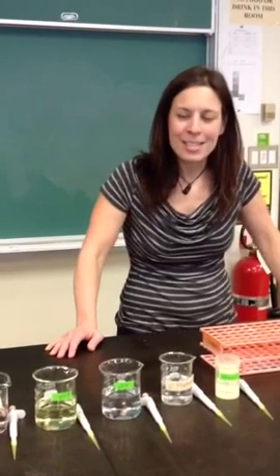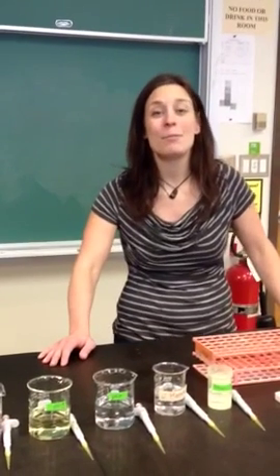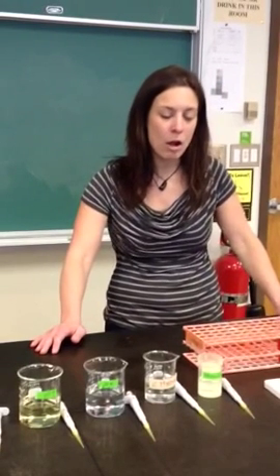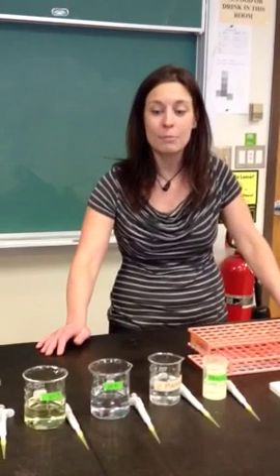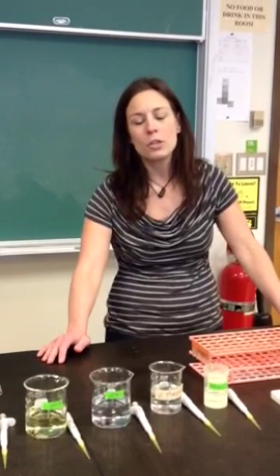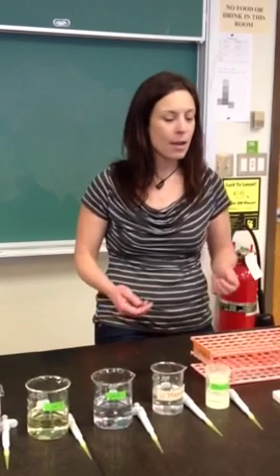Hello everybody. Well, as promised, I will do the experiments that we didn't have time to finish this week when we were in lab. So right now, before I even get started, I will test all my reagents, do my controls, and make sure that I have expected results with my controls so that I don't run my experiments, have no results or weird results, and waste a lot of time if it's the chemical's fault.